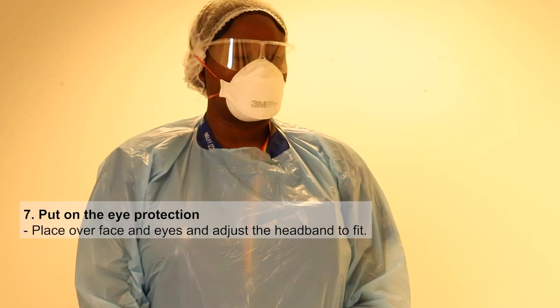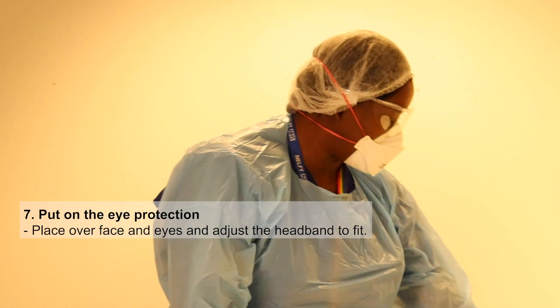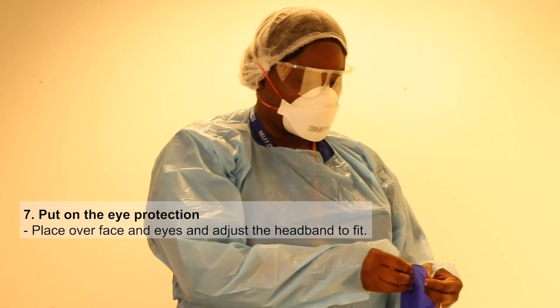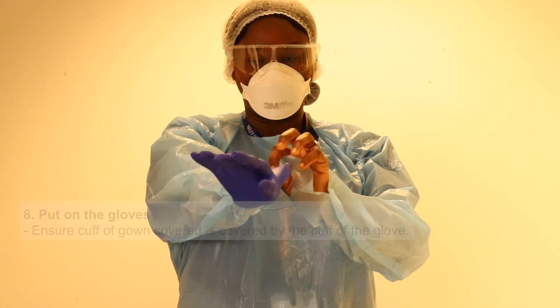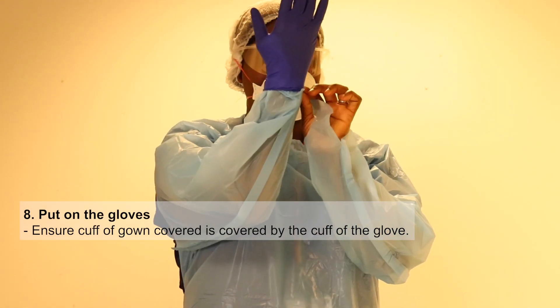The final thing you do is put your gloves on.